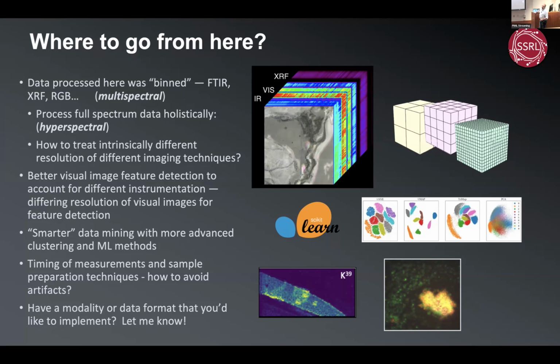Again, smarter analysis for data mining. There's a lot of good stuff out there, different types of clustering that work way better than the old-fashioned PCA analysis. And luckily, I'm pretty good at computing, but I don't need to invent the wheel again. There are lots of great toolkits for people to use. It's not that you need to learn how to use them. We just need to make them accessible and easy to use, right? And that's what we're doing here.